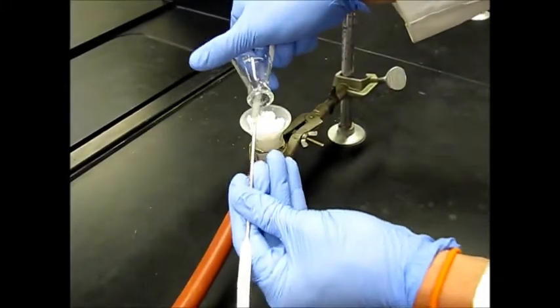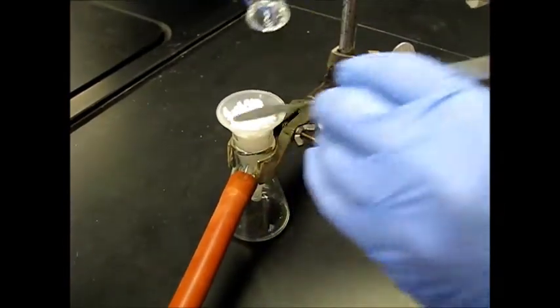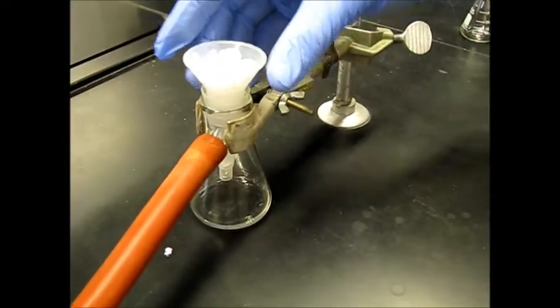Alright, so we're getting the last little bits out of the Erlenmeyer flask here. Cool. We're going to allow this vacuum to suck dry.